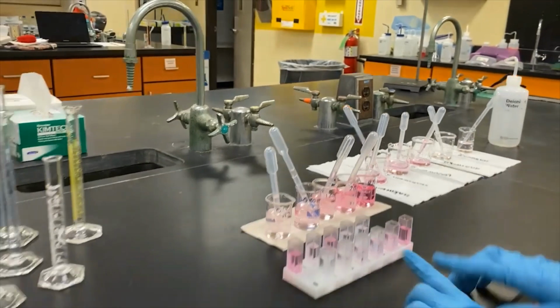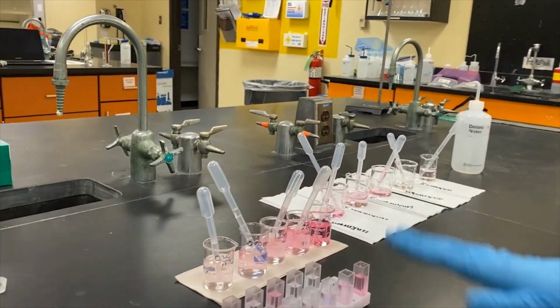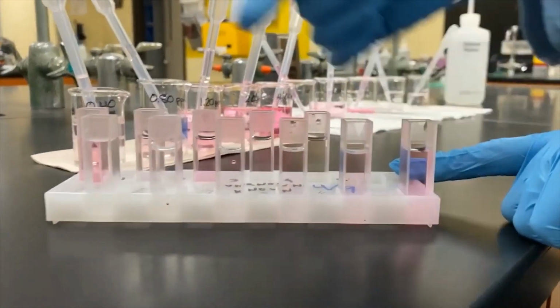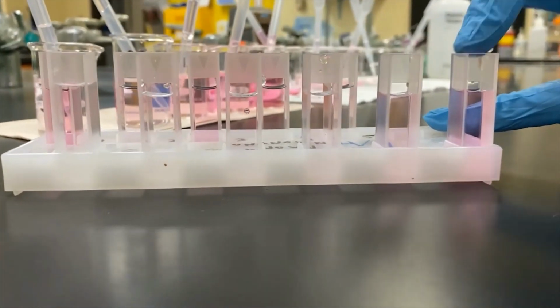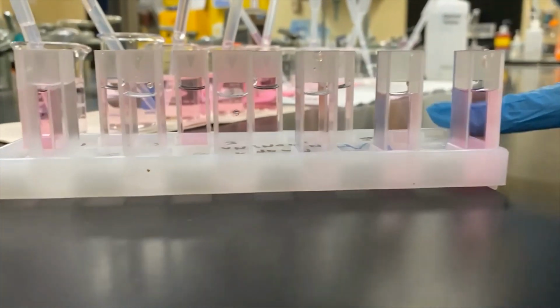So we're going to go ahead and take a picture of this and show you at a little bit better angle so it's not as cloudy on the video. But this is generally your trend. So in the front you see your known solutions here, going from least concentrated to the highest concentration. And this is nice to compare to the blank here.